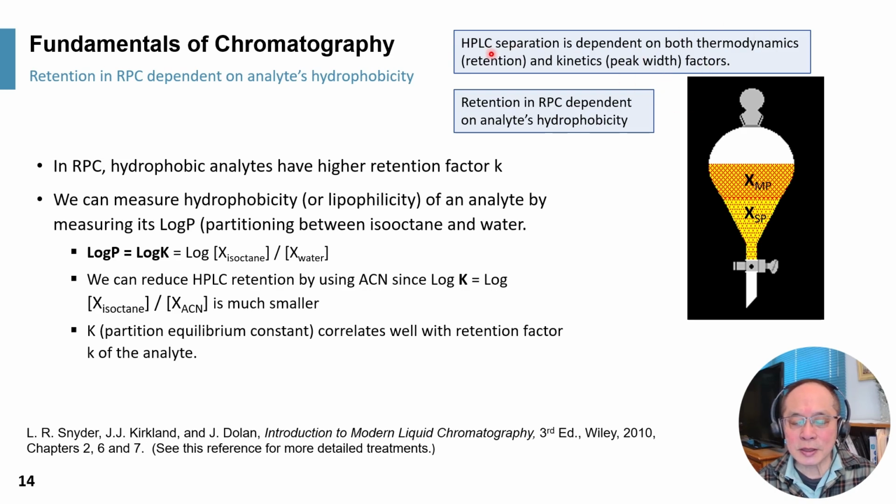These two factors are important and fundamental in chromatography. So retention is dependent on the analyte's hydrophobicity, meaning that if you have a very lipophilic or very hydrophobic analyte, it would be retained under reverse phase condition. So hydrophobic analytes have higher retention, or higher retention factor K.